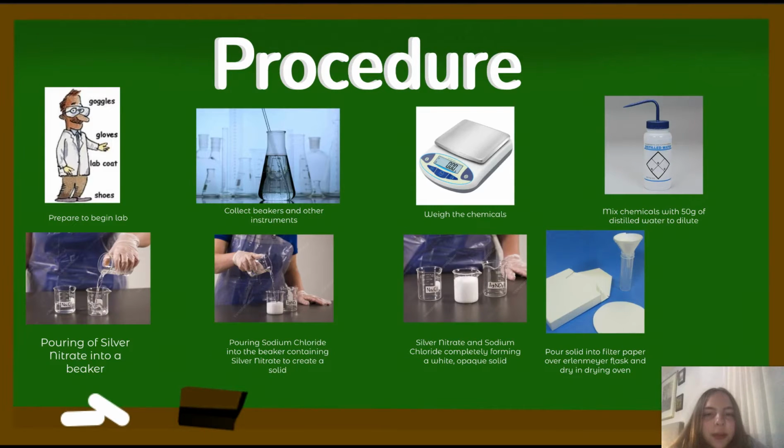Now that we have explored the chemical equation behind this experiment, we can look at the physical procedure I had to follow in order to officially determine the relationship between sodium chloride and silver nitrate. In this lab, we used lab safety equipment, as silver nitrate would stain our skin black, and both chemicals are not truly safe to ingest or inhale.